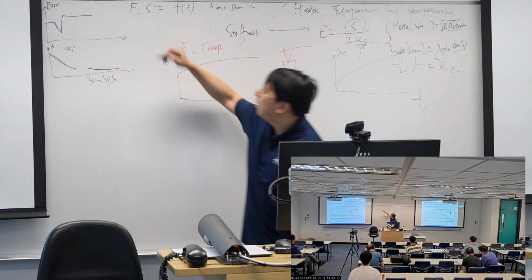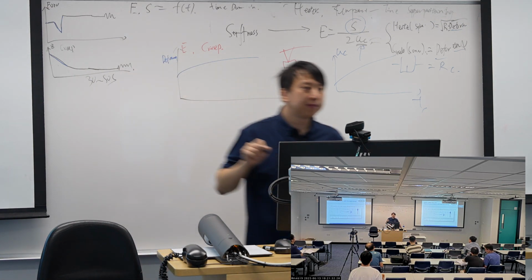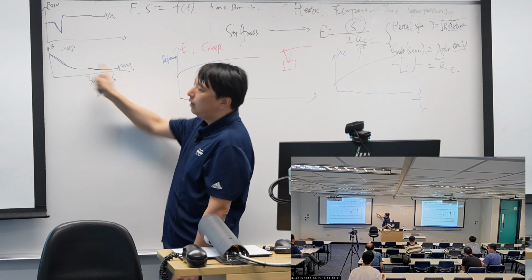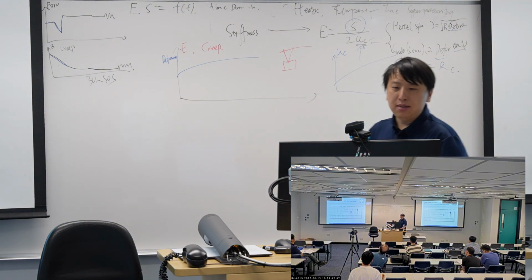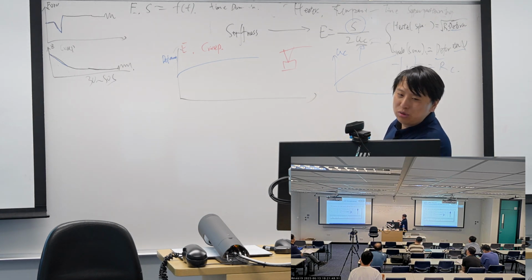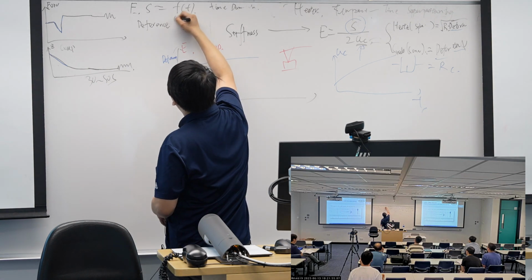And then we start to do the modulation. With that, we can reduce the effect of the creep, but it does not eliminate it. So Bruker introduced a way called reference frequency.